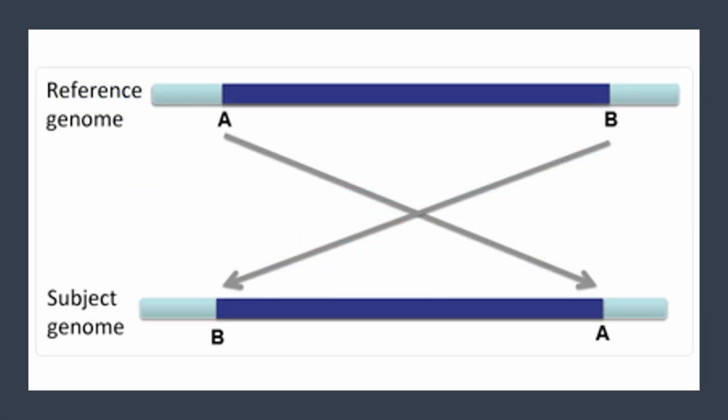Structural variants are difficult to visualize in IGV because the subject's DNA that includes the structural variant is mapped to a reference genome that does not include the structural variant. To notice structural variants, we have to keep track of read direction, primer direction, and insert size. When these are not the expected size or orientation, it often indicates the subject's DNA is being warped in strange ways to force a fit to the reference genome in IGV. It's up to you to figure out how the subject's DNA is being warped and determine whether that means the subject's genome contains a structural variant.